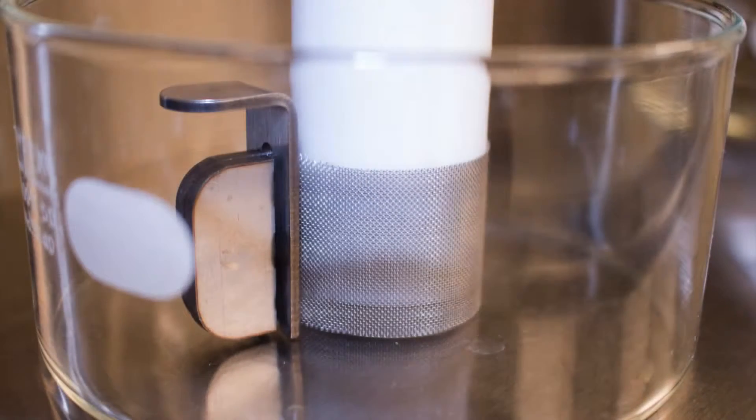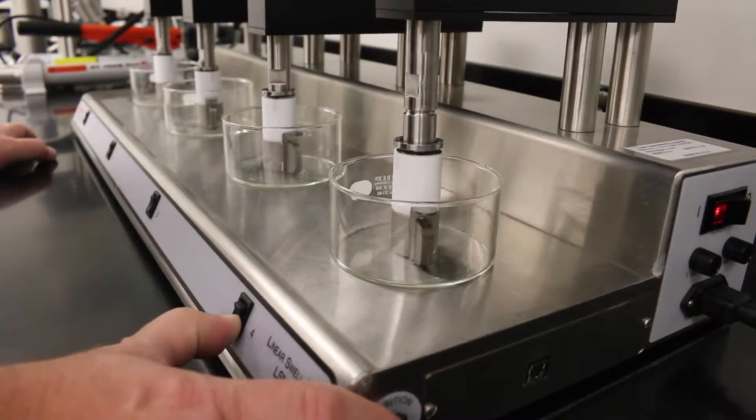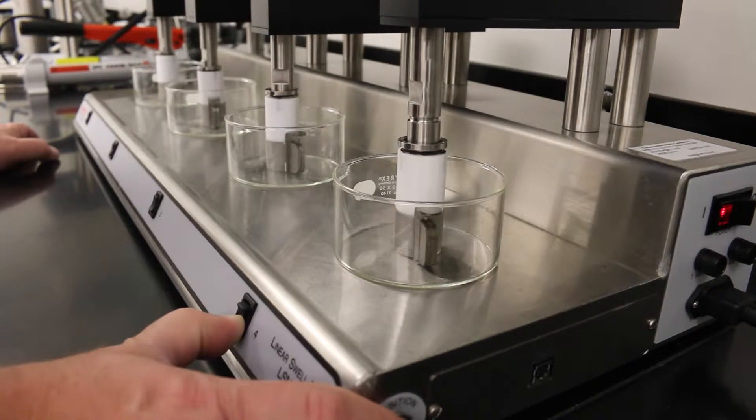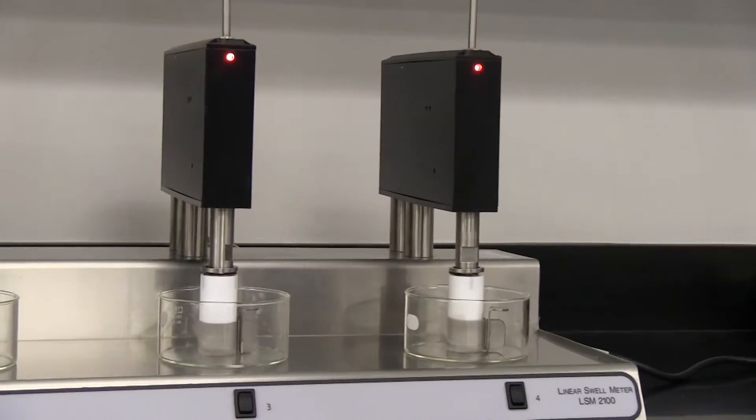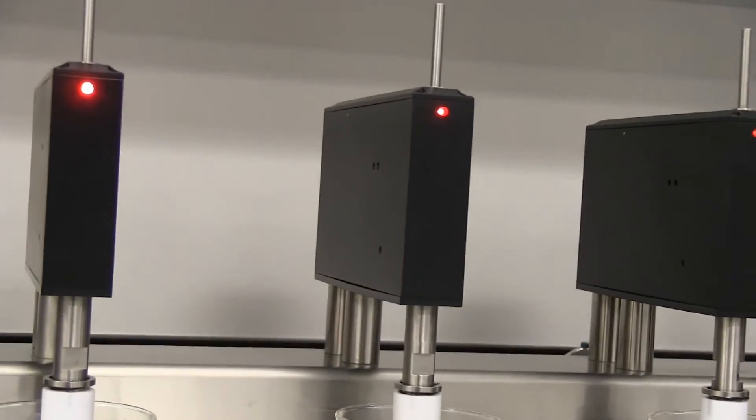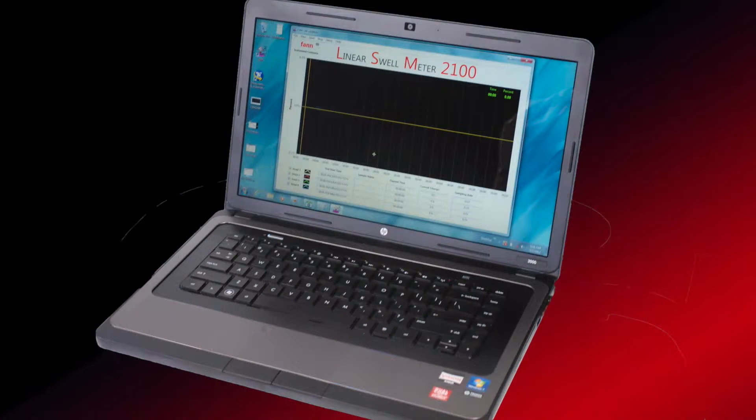It measures hydration or dehydration of shale cores exposed to drilling fluid or brine. The Linear Swell Meter measures and records swell over time. Each LSM unit has four measuring heads and can run four samples at once. The included software allows a single computer to control up to four LSM units.